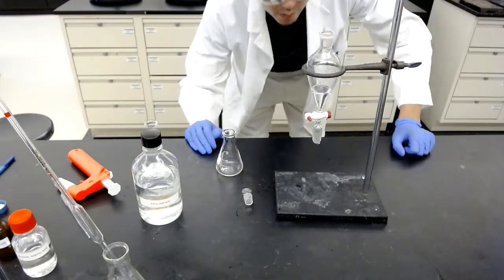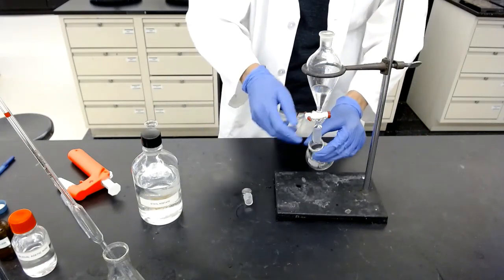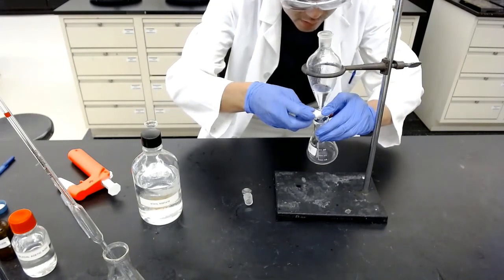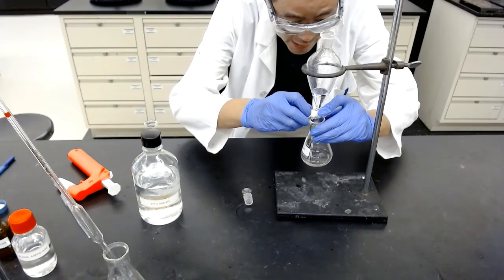And of course, you can imagine it's separated into 2 layers, and we need the bottom aqueous layer. Slowly drain it out.